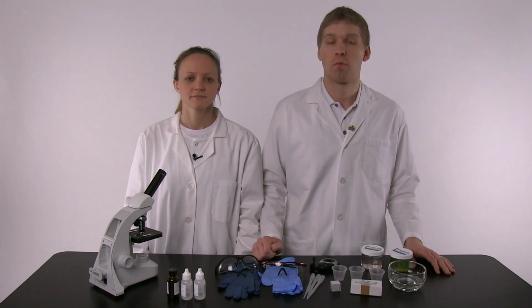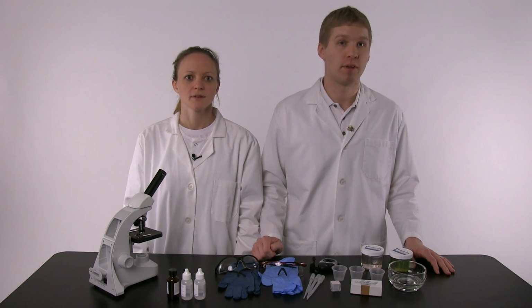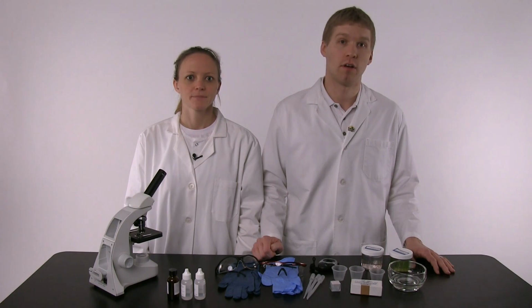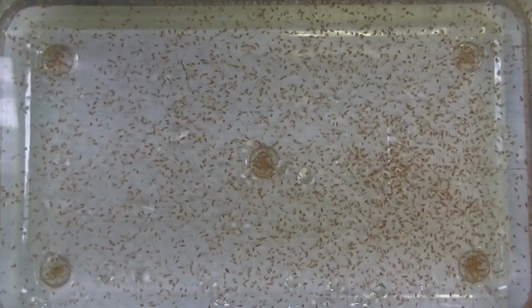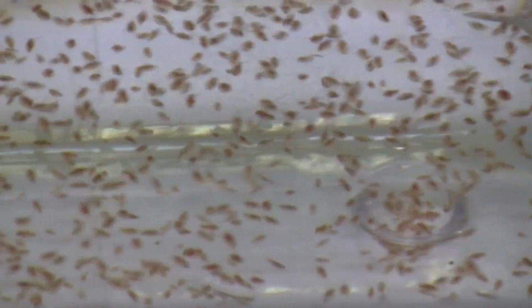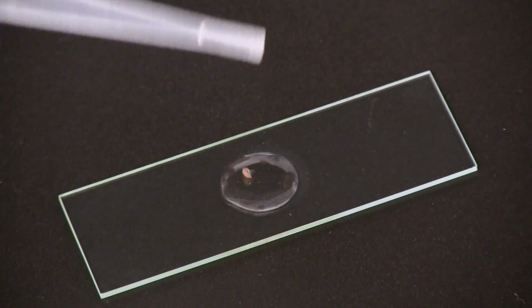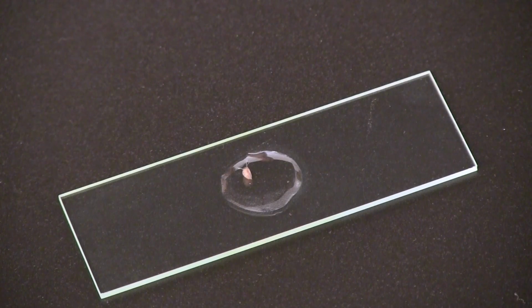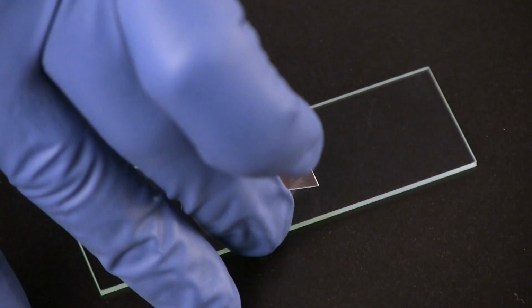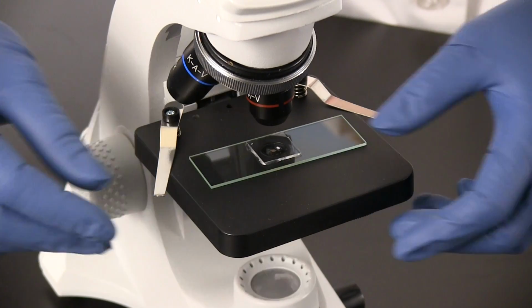We also recorded the normal behavior, along with the associated behaviors of each Daphnia after being submerged in 5 milliliters of aerated drug solution. Normal behavior of Daphnia consists of nonlinear motions, also known as jerky movements, looping, and consistent swimming. In order to capture the heartbeat, we used a concave well slide with a cover slip to hold the water flea in place under a compound microscope.